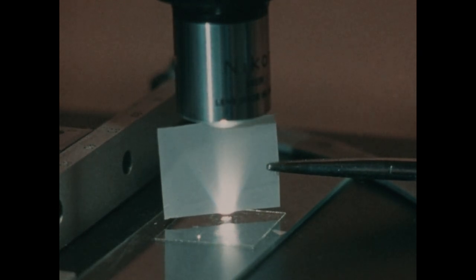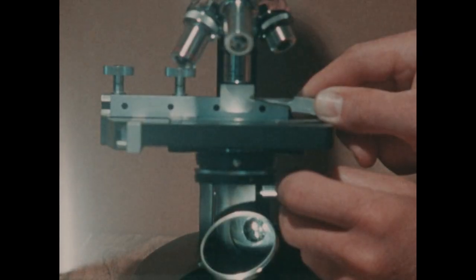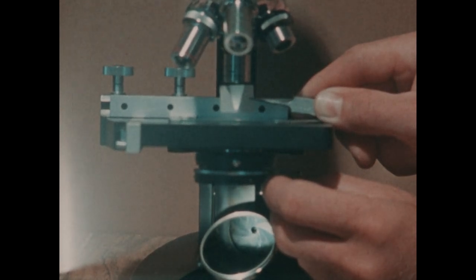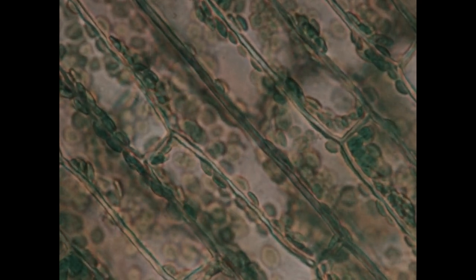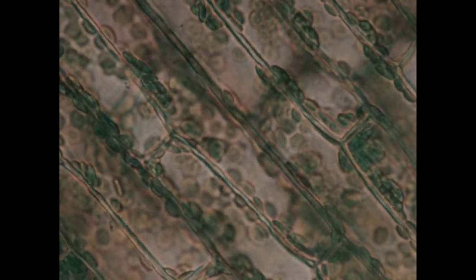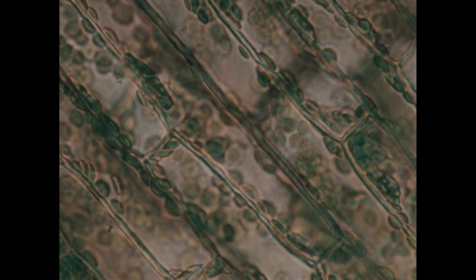Focusing light onto the leaf with a condenser improves resolution. However, the image now has a washed-out appearance due to flare caused by light spilling in around the edges of the objective. Eliminating flare is the purpose of an iris that shapes the cone of light focused up from the condenser so that it just fills the lens. Looking in the microscope, flare vanishes as the field just begins to darken, producing a high-resolution flare-free image. The plant's food-making bodies resembling green jelly beans now show up clearly.